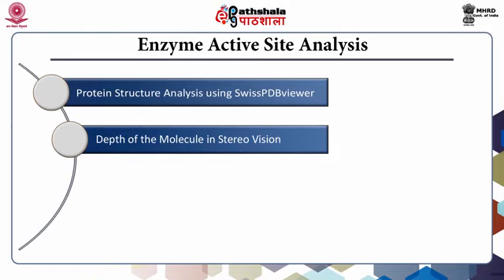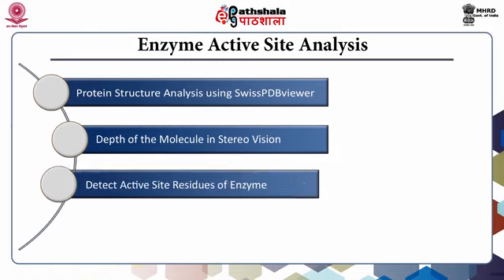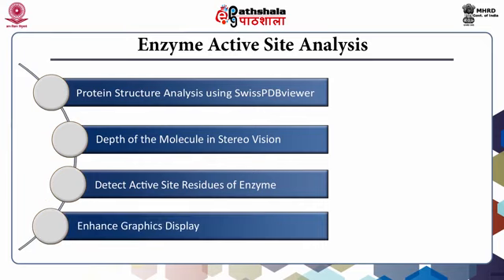This will be followed by the objective to detect the binding pocket residues using various commands of the SwissPDBViewer and also use literature information of the active site catalytic residues to complete the picture of the active site having a bound substrate. Finally, we will learn to enhance the graphics for appreciating the display or the complete picture of an active site on the enzyme.